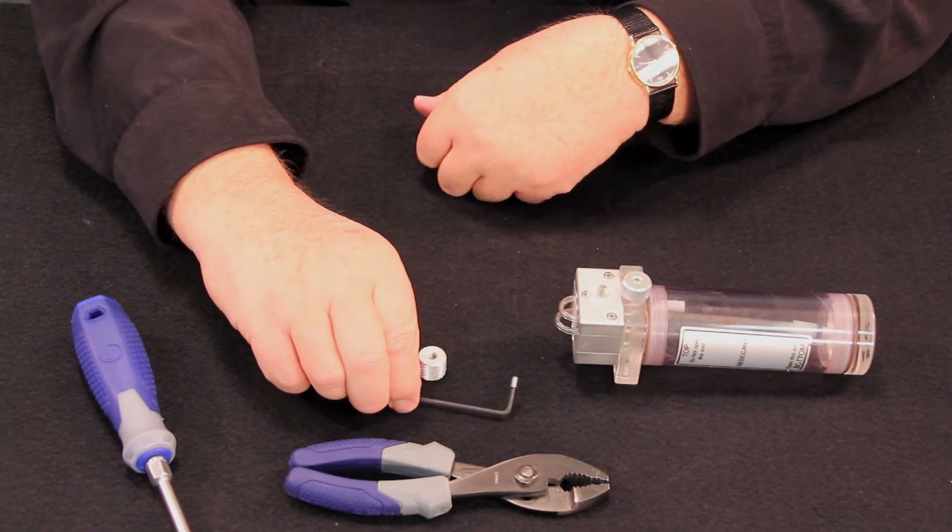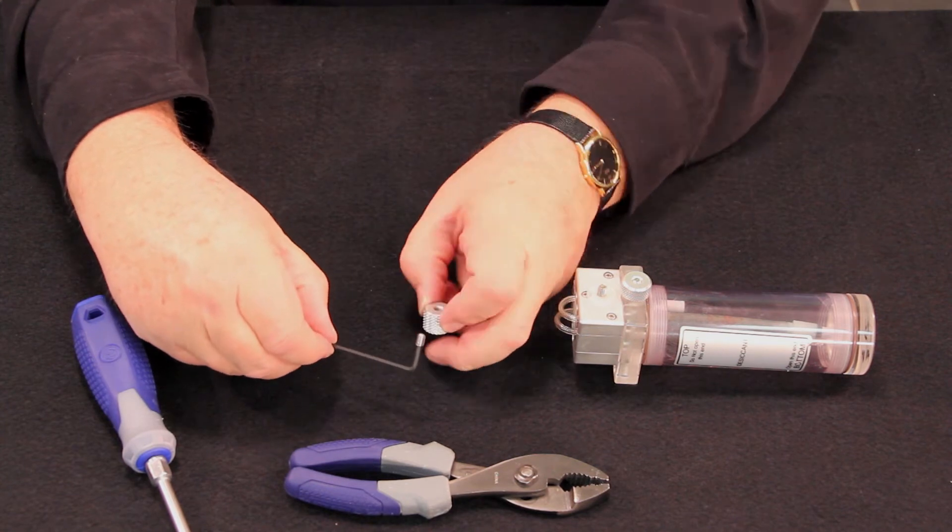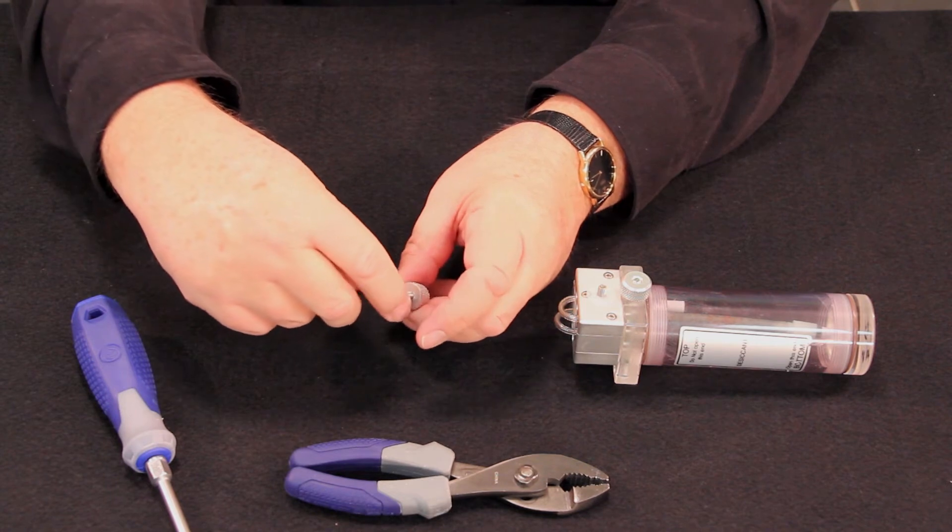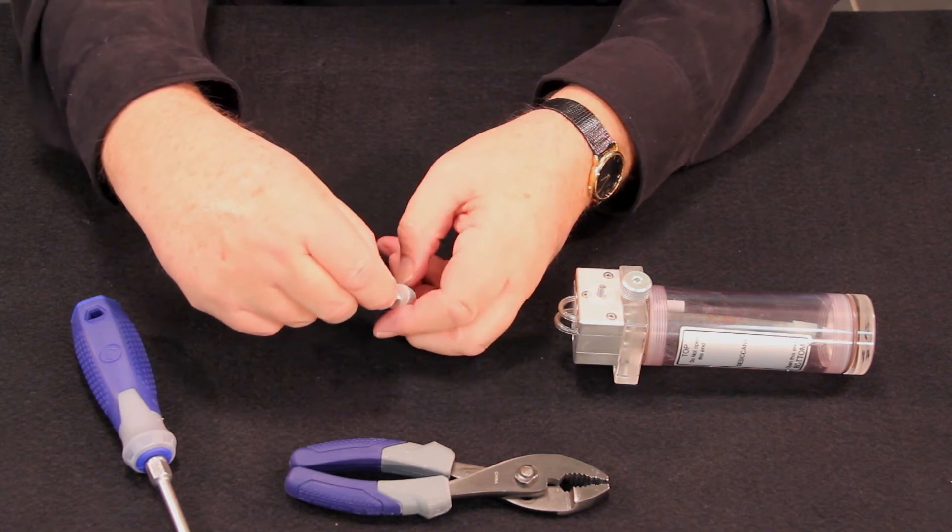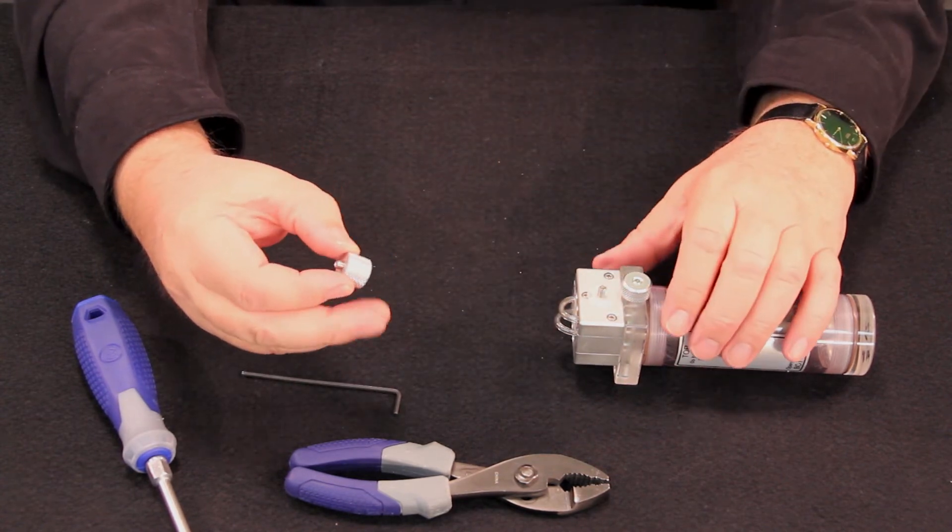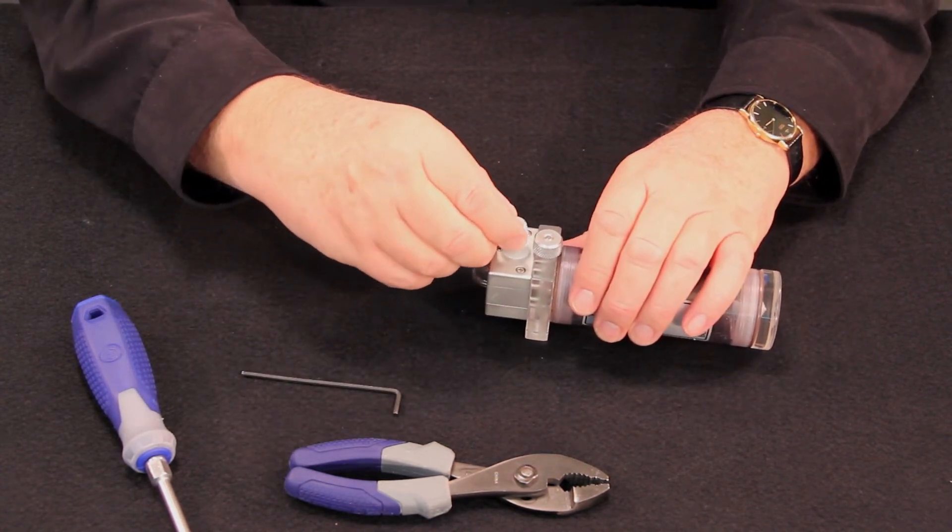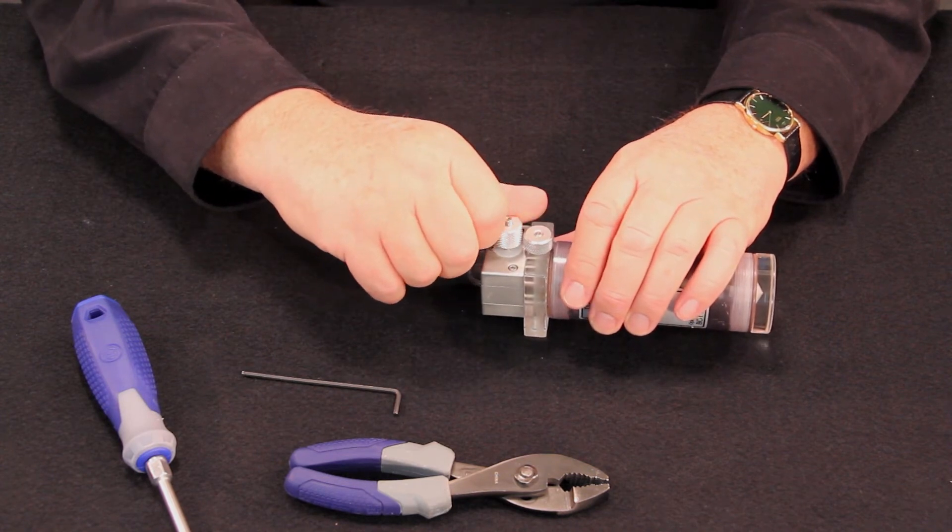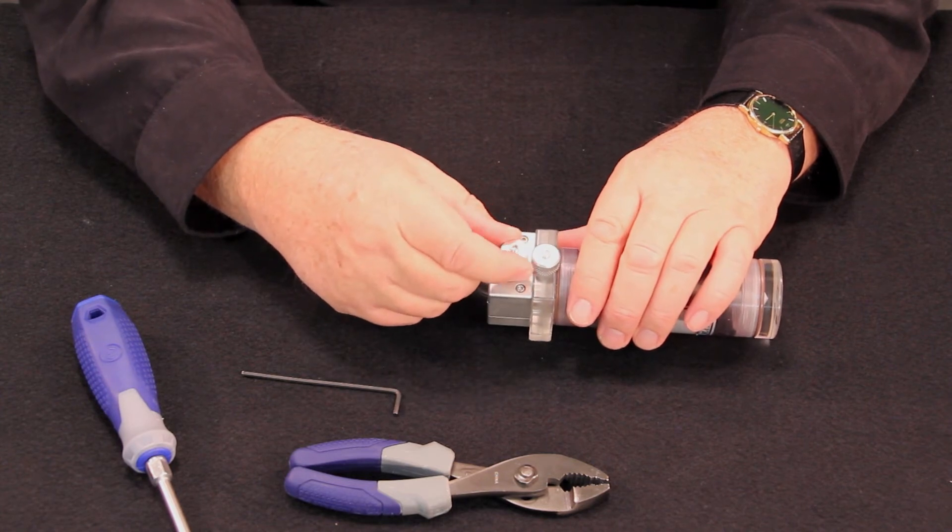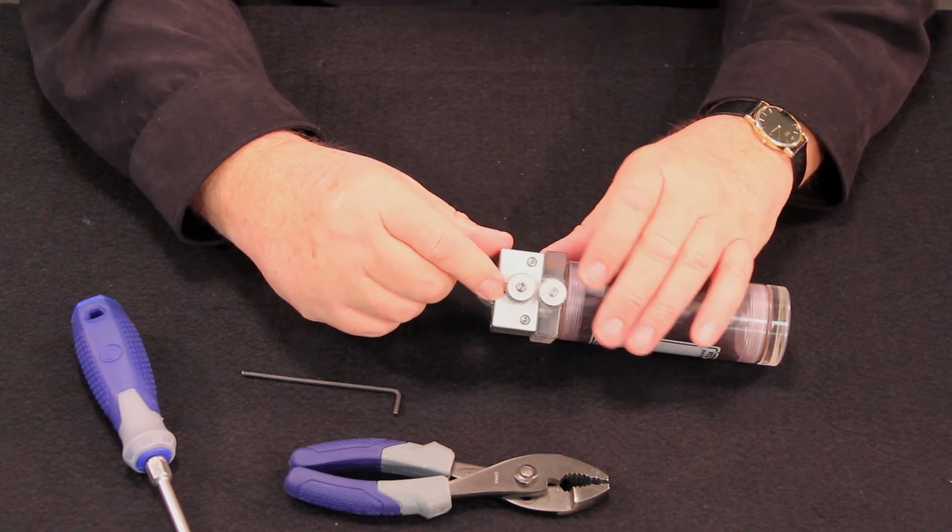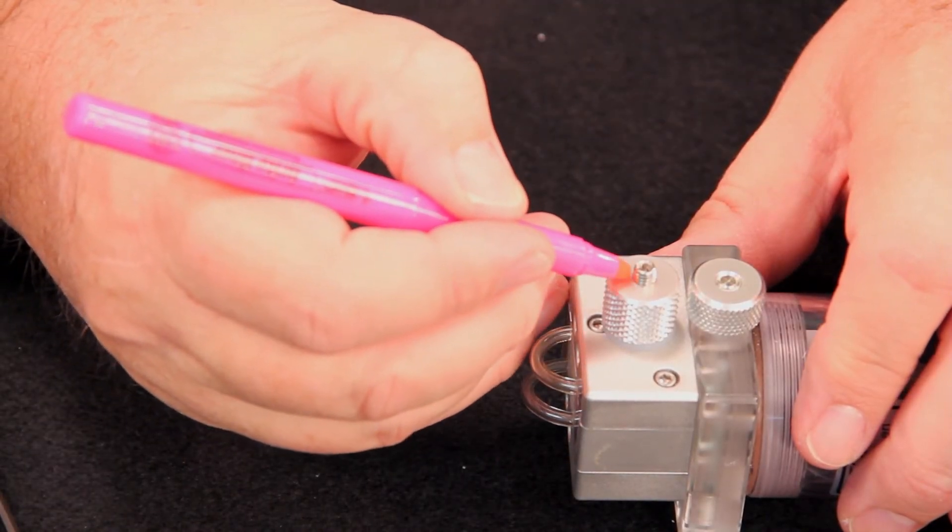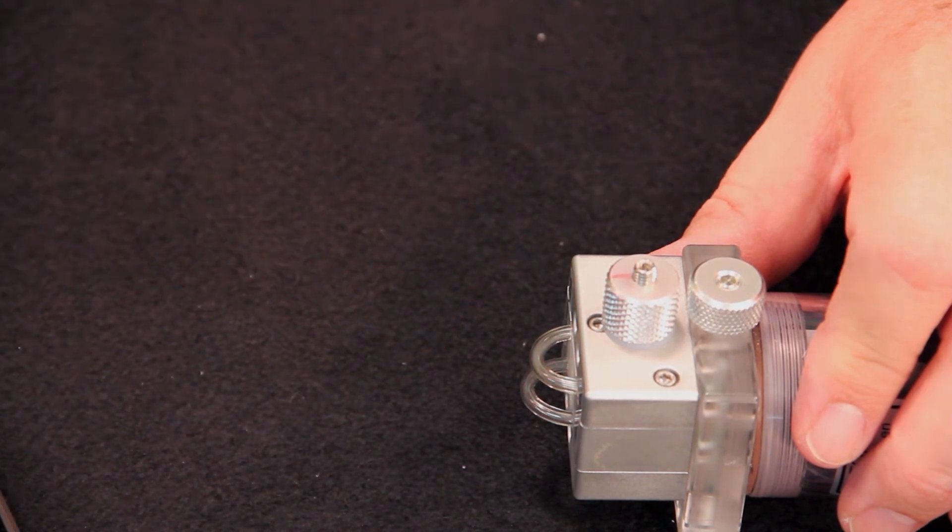Next, you should install the set screw into the knurled flow control knob. Only partially install the set screw, then install the knurled control knob on the flow control screw. Finger tighten the knob up to the white plastic washer. Mark the position of the knob with a felt pen.